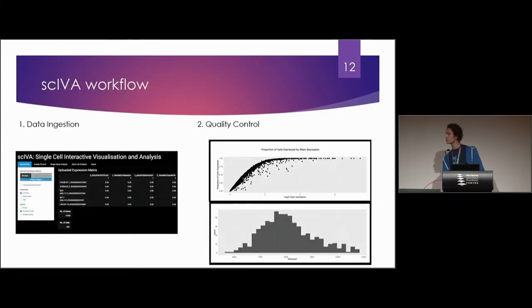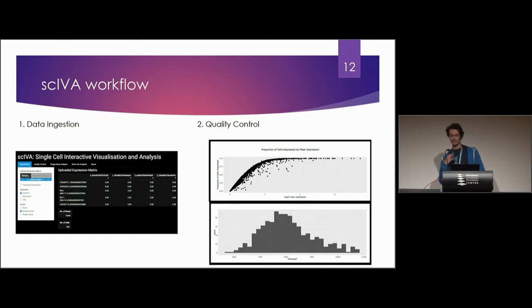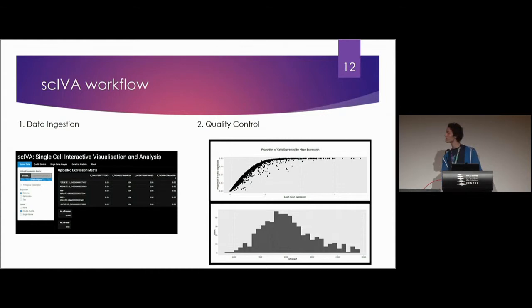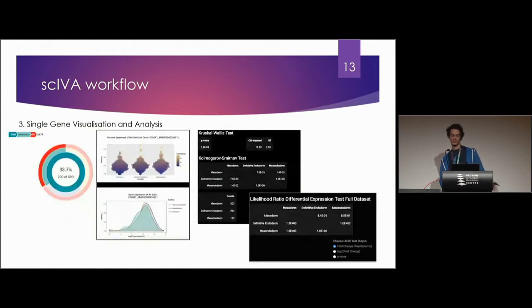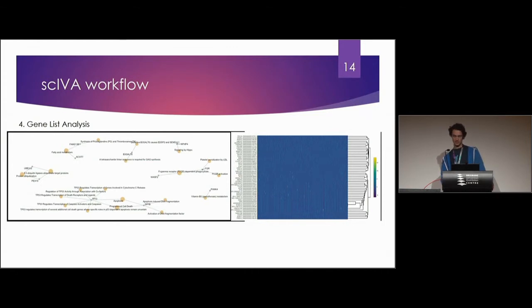The Skiva workflow, this is kind of a snapshot of the interface that you'll be working with. You've got the data ingestion step, quality control, single gene visualization and analysis steps. And then lastly, gene list analysis. So now I'll go into the specifics of each step.